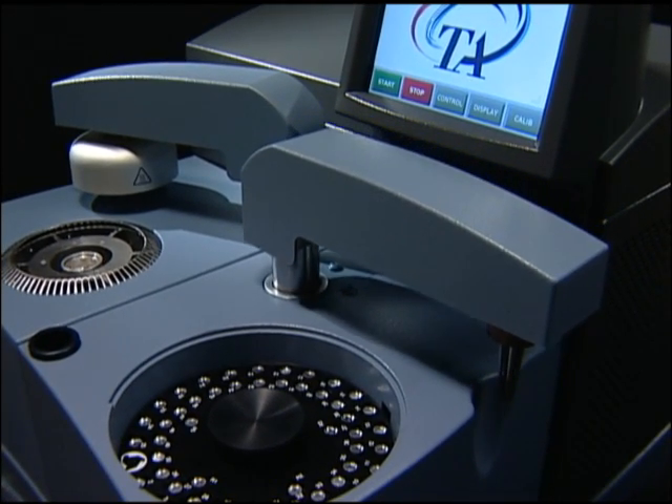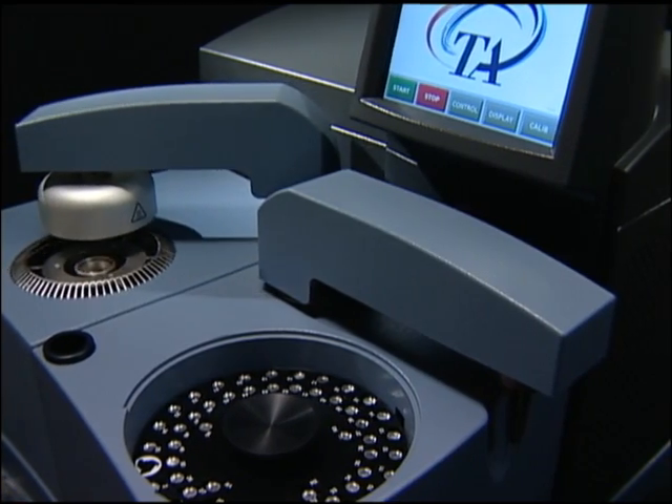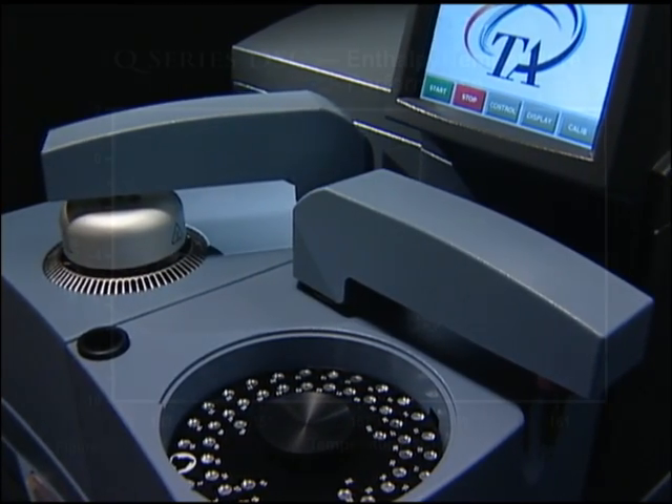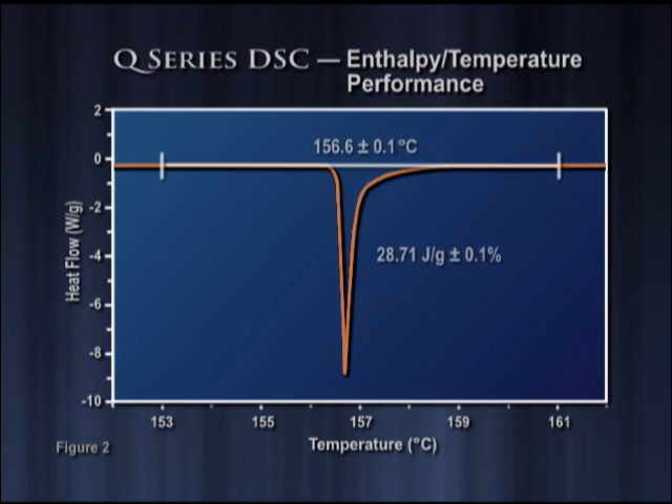The accuracy and reproducibility of the temperature and enthalpy measurement is unmatched in the Q-Series DSC. Figure 2 contains 10 replicate measurements of the indium melting peak. The enthalpy precision of this measurement is within plus or minus 0.1%, and the temperature precision is plus or minus 0.1 degrees Celsius.